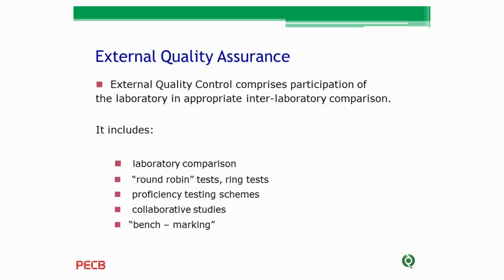In the ISO standard, it is not a must. It is one of the quality control mechanisms recommended by the standard, but most of the accreditation assessors ask for your laboratory to participate in such programs.